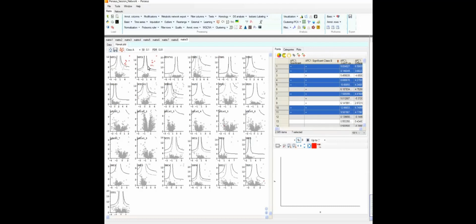Then it makes sense that APC2 is probably a very similar protein. We have the same specific binders here, just one more. And we don't find them in the other experiments. So it means that they bind only that bait. As you can see in this graph, we can find it, but just one of these genes was just an unspecific binder. So it just ended up as some noise here, but that is what we expected actually. So then we can move on.